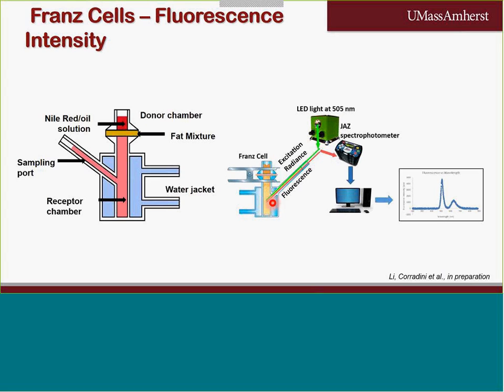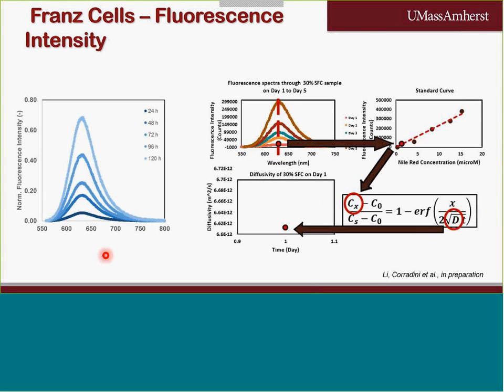With the spectrophotometer, the results of this experiment allow us to see how we have an increase in fluorescence as time went by, using, of course, a simplified version of Fick's law. We were able to get the diffusivity at each time.